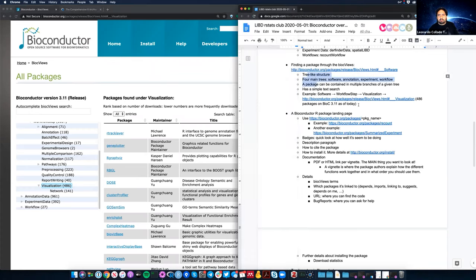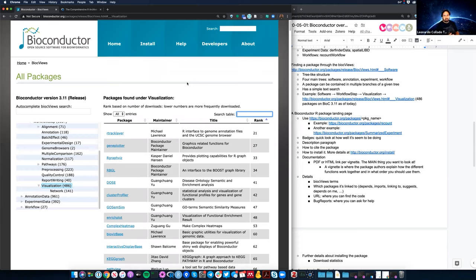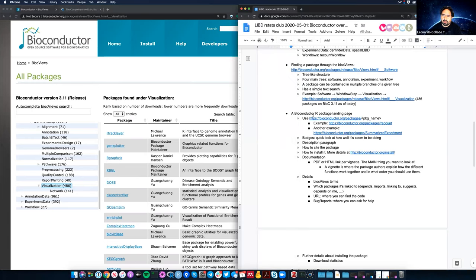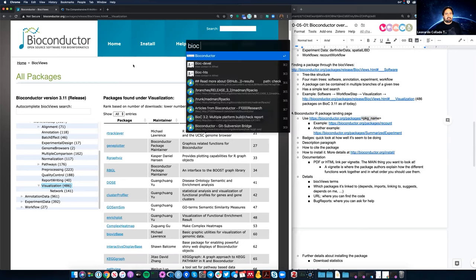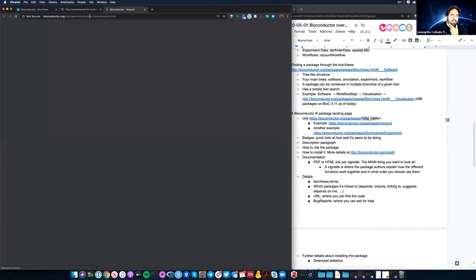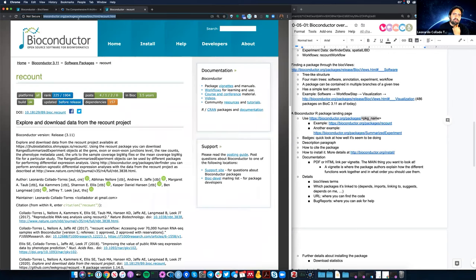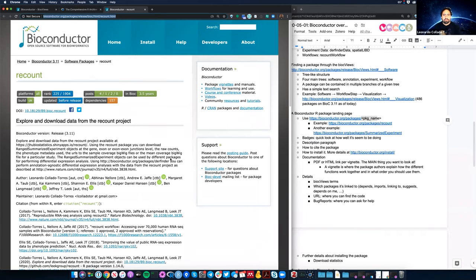Now let's say you found a package you want to work with. Bioconductor has a nice URL redirecting structure where you type bioconductor.org/packages/[package name] and it will redirect you to the landing page for that package. For example, I want to go to 'recount' — so that's bioconductor.org/packages/recount and it automatically redirects me to the actual website. This is one of my packages.